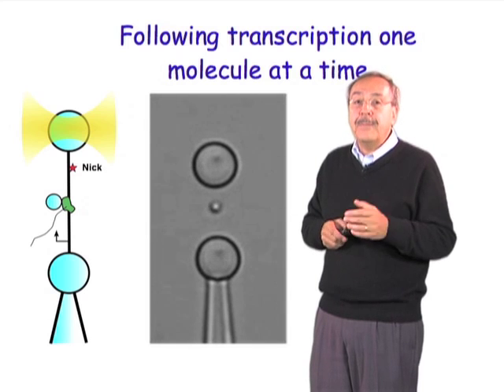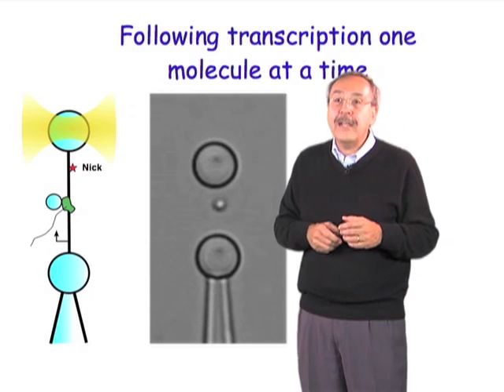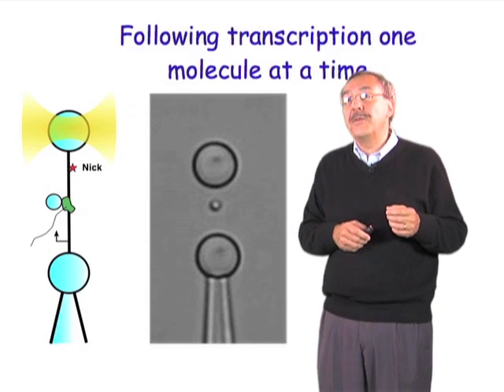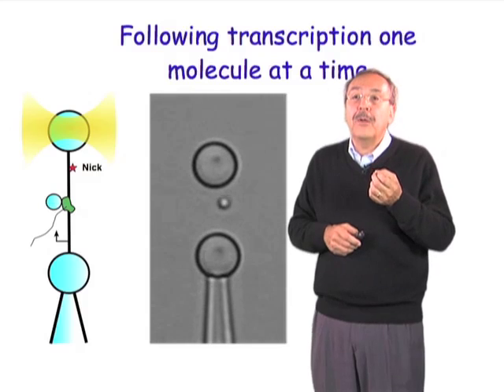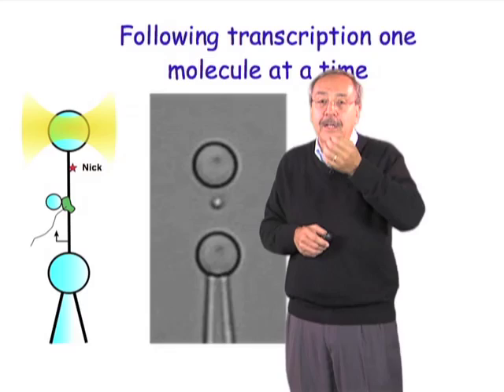Again, this type of experiment allows you to follow the dynamics of the reaction, not just the average behavior of RNA polymerase molecules, but how individual molecules behave one time and the following time and the following second and so on and so forth.